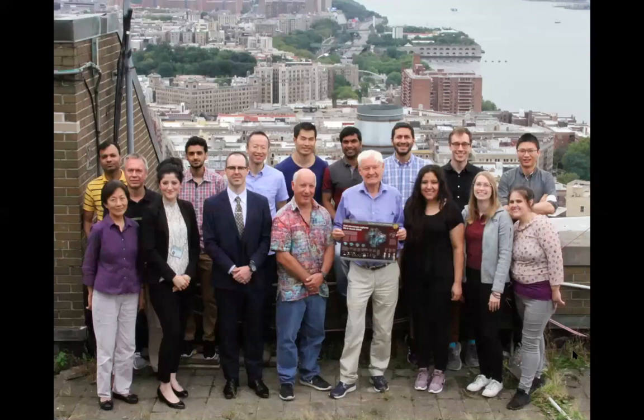These big machines start at $5.5 million. And so the 100 kV machines would really be a very big new development.